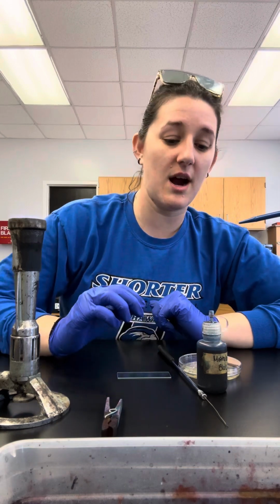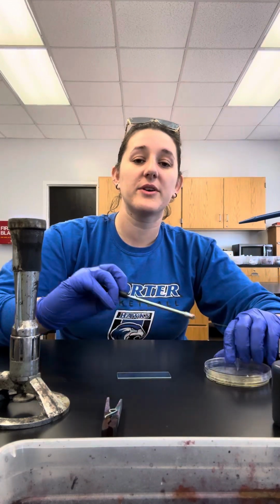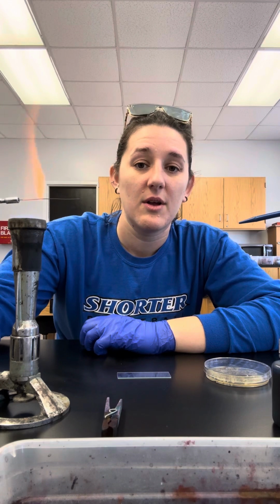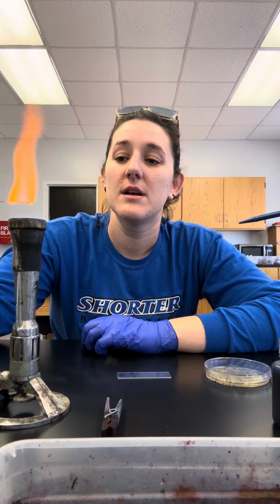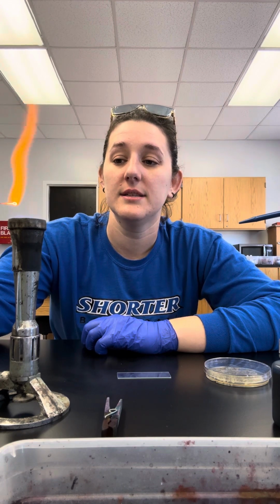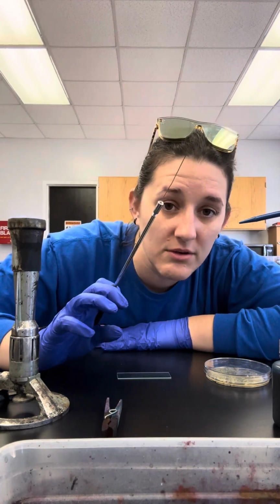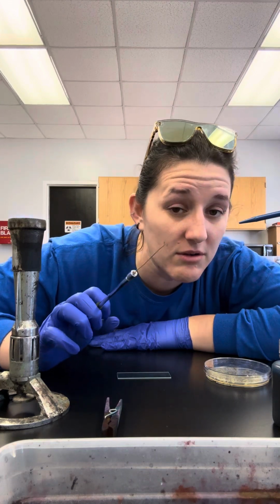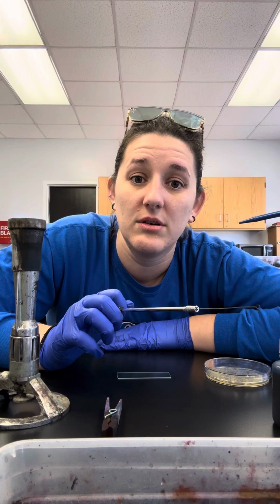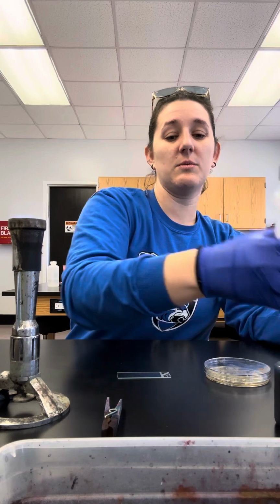Get her going. All right, so the first thing we do, because our sample is on agar, is we create a wet mount for our slides. So we sterilize our equipment. And remember, we put this on the top of the innermost cone because that is the hottest part of the flame. Now, the middle of that innermost cone is not hot at all. So, all right, we let this cool. Then we do our distilled water on it.